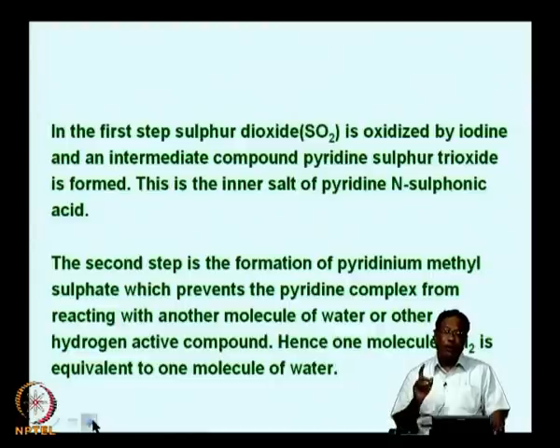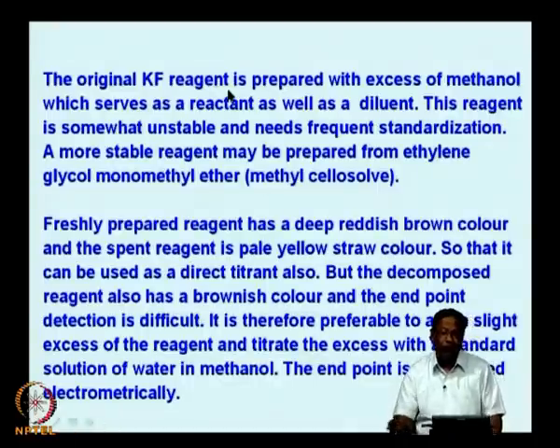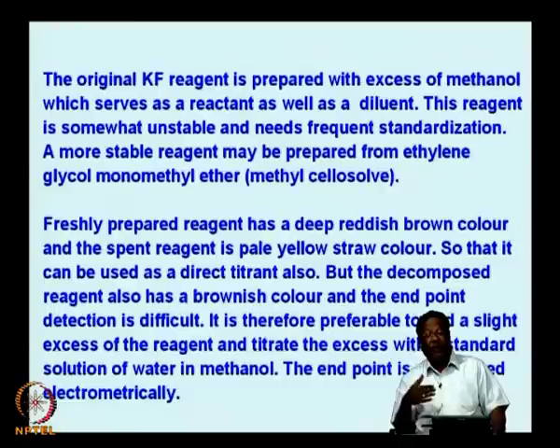Therefore, we make sure that only one molecule of iodine is equivalent to one molecule of water. So the stoichiometry is established: 1:1 stoichiometry. The original Karl Fischer reagent is prepared with excess methanol, which serves as a reactant as well as a diluent. This reagent is somewhat unstable. When it is prepared freshly, it is good, but over a period of time it decomposes. Therefore, we need to standardize the Karl Fischer reagent frequently. Whenever you want to use any Karl Fischer reagent, the first step is to standardize it and then use the new standard value for the calculation of the water in the sample you are analyzing.